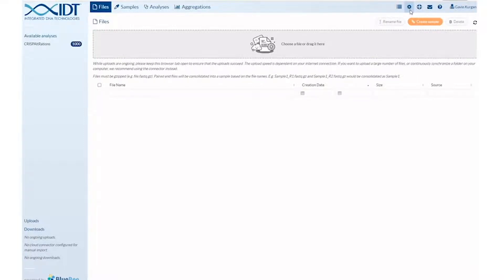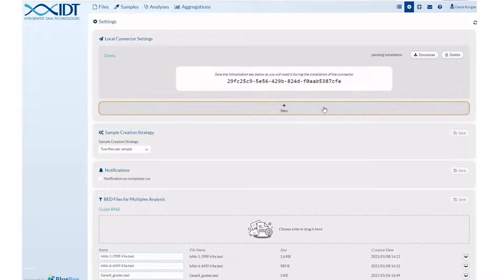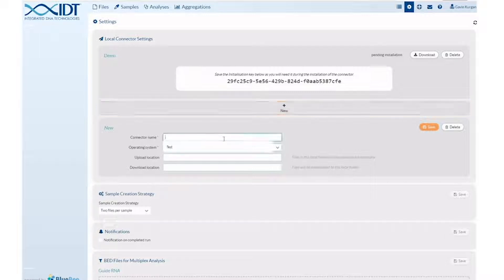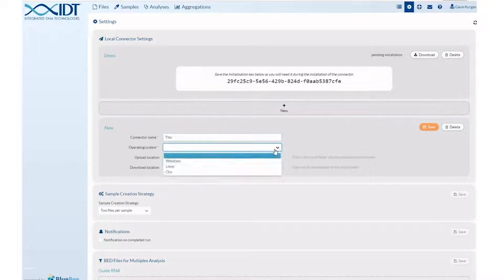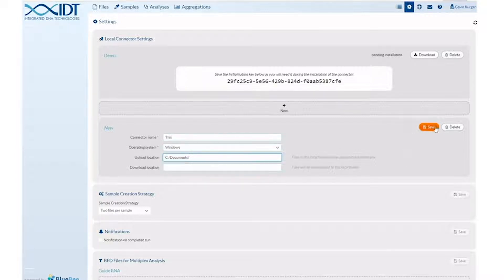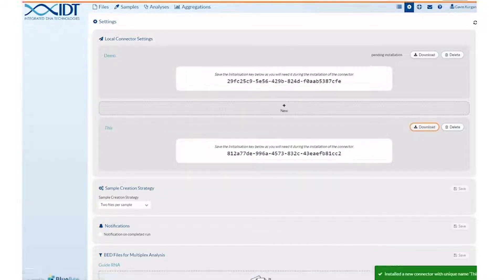Navigate to the settings page indicated as a gear icon. Here you can transfer data from local or cloud storage systems. Local connectors stream data from local data storage to the platform. Set it up by clicking the new button under local connector settings. From here, specify the name of your connector, the computer operating system, and the upload or download location of your data. After saving this information, you will need to download and install connector software.